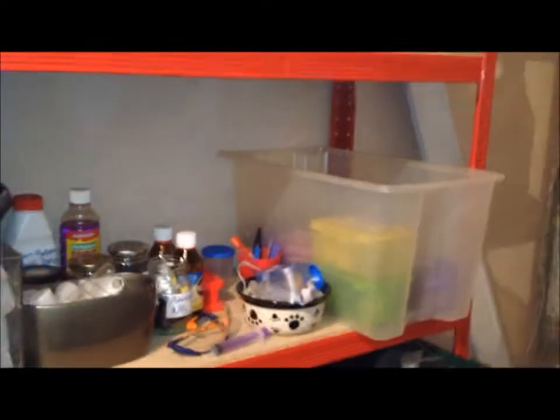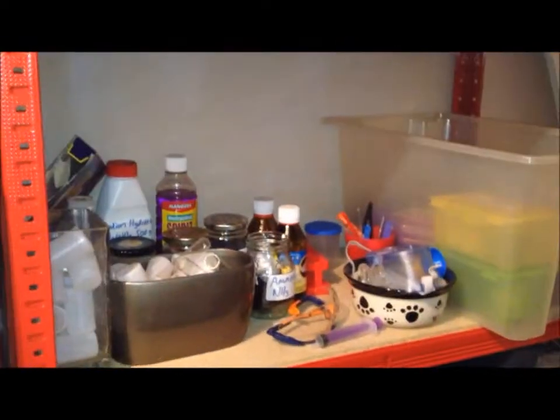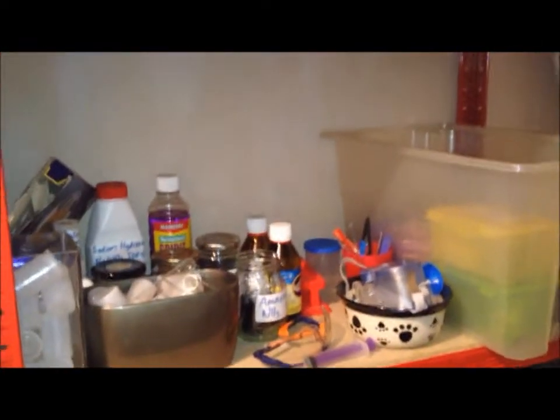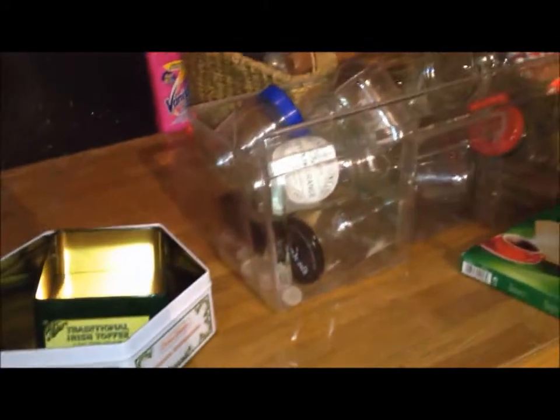I'm going to do a tour. My lab is actually in my garage, in one end of my garage. I have a few shelves to work with and a table which I use to do some experiments, although most of them take place outdoors.